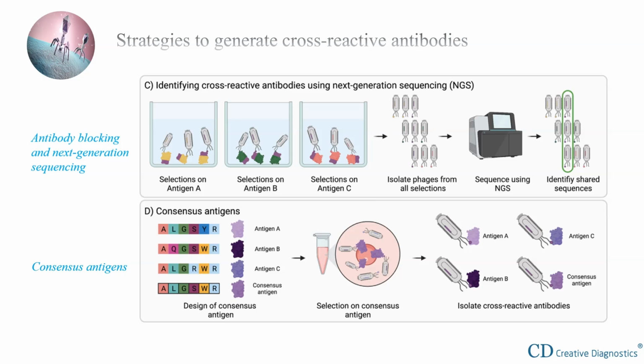For positions with multiple possible amino acids, different approaches can be used, such as choosing amino acids based on similar chemical properties or the one with the highest predicted immunogenicity. Using consensus toxins to immunize horses has successfully generated polyclonal broadly neutralizing antibodies against short neurotoxins from various snakes. It is hypothesized that this consensus antigen approach could also be useful in phage display-based antibody discovery campaigns.